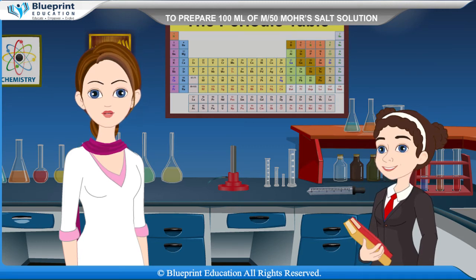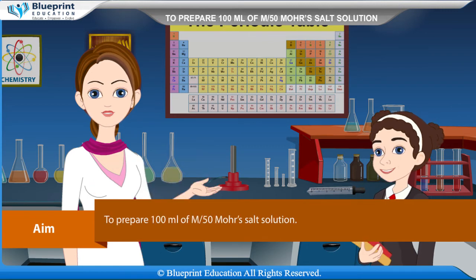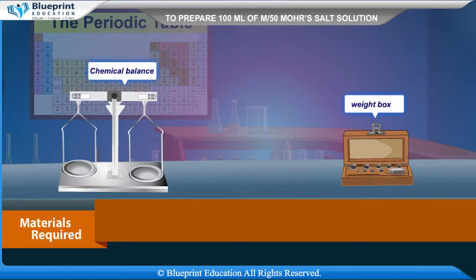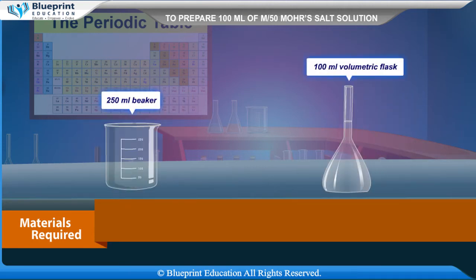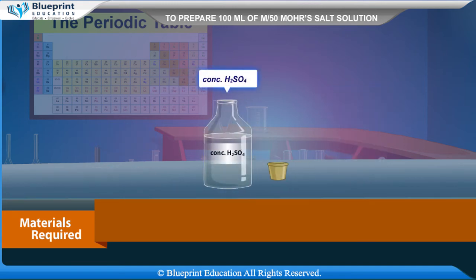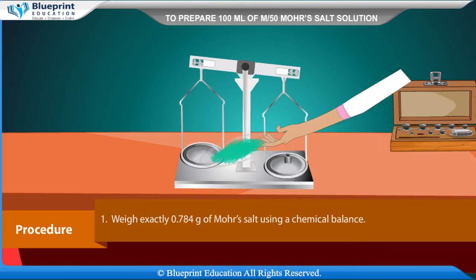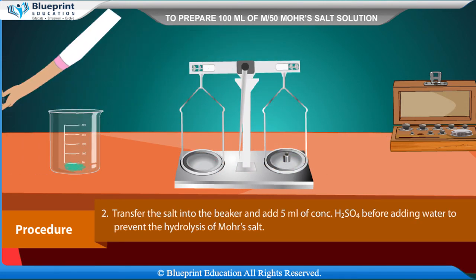Let's do an experiment to prepare 100 ml of M/50 Mohr's salt solution. Our aim is to prepare 100 ml of M/50 Mohr's salt solution. Materials required: chemical balance, weight box, watch glass, glass rod, 250 ml beaker, 100 ml volumetric flask, wash bottle, funnel, Mohr's salt, distilled water, and concentrated H₂SO₄.